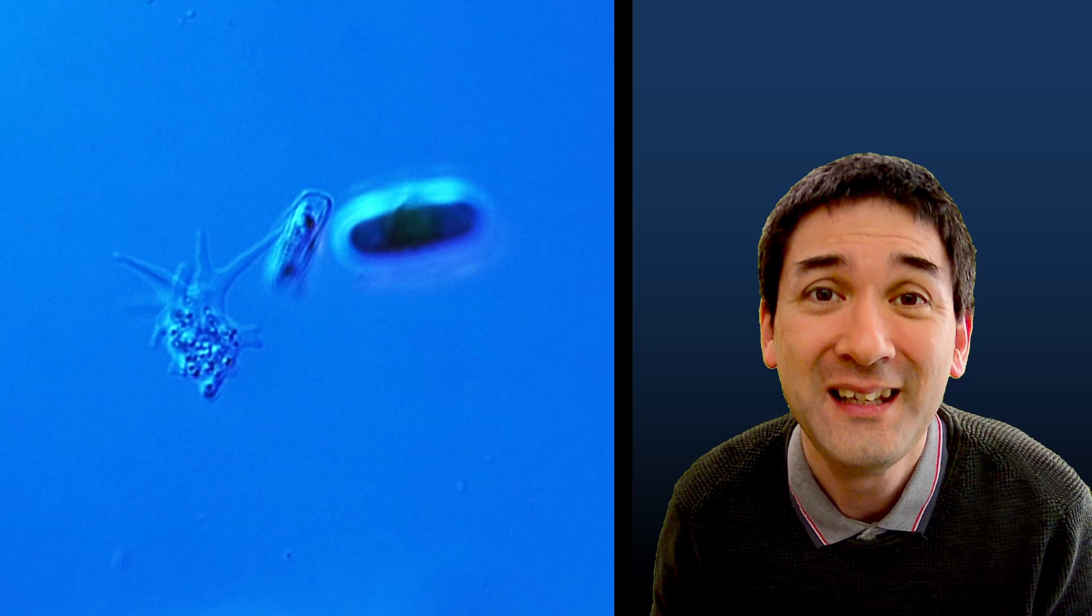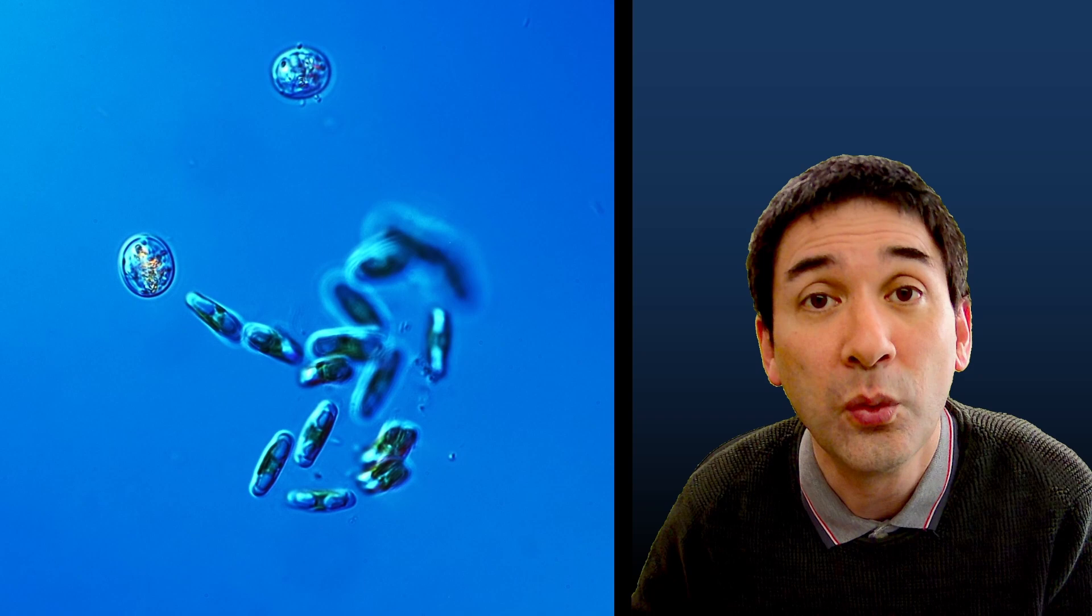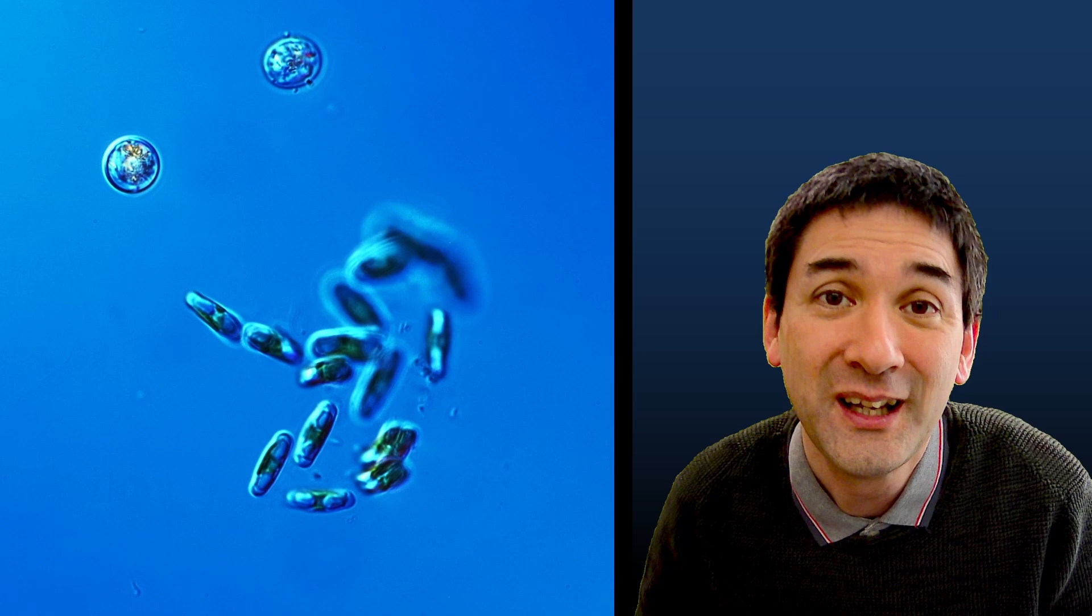The question, of course, now is where do they come from? Well, there are really two possible sources. Look here, here's another one. One source, of course, is that they were introduced with the water that I filled, the tap water. Or it could be that some of them are also carried over the air or dust, for example. And then when they fell into the container, then they started to reproduce.